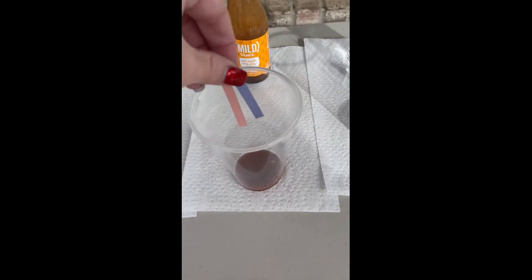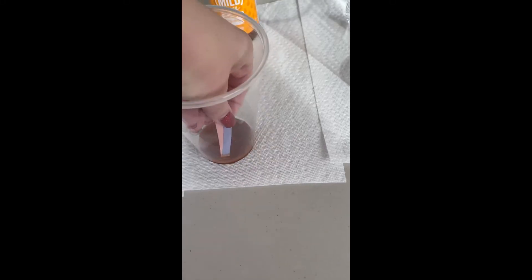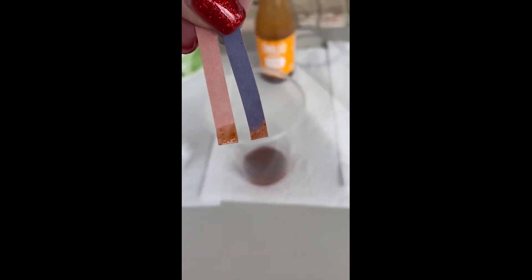Let's try some hot sauce. Dip it in and see what color it turns. You will see that our blue litmus paper does turn pink, so this is going to be an acid.